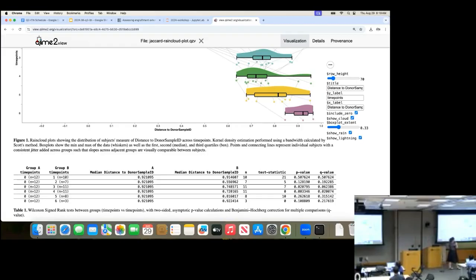Absolutely, you guys are totally right. Yep, and based on the Q value, we're kind of near significant at time point 3. So we'll take that as you will. But by time point 4, by the time where we've taken a couple of weeks post FMT, maybe hopefully that microbiome has kind of stabilized. Everything we see shouldn't be transient because it's been long enough for the gut microbiome to kind of wipe any transient microbes out.